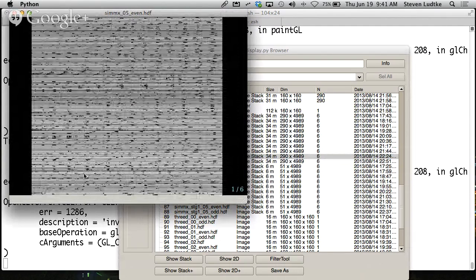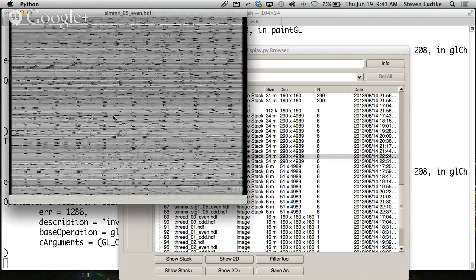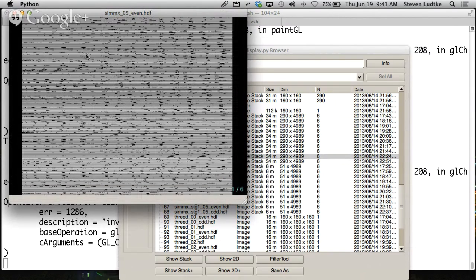Any place where you see this white streak is a place where it didn't have to sample that orientation, it could ignore it. So you can see in each line, it really doesn't have to do very many of these similarity comparisons at all. From 290 down to 50, we're saving about a factor of 6 here in computation.